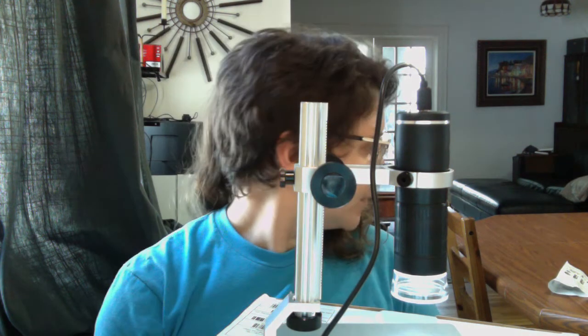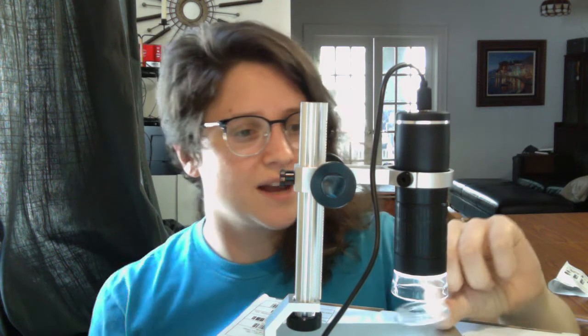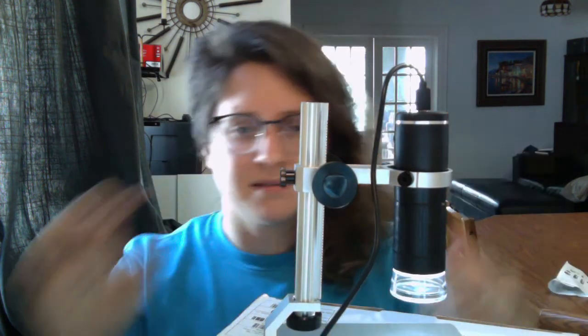Other than that, a couple of features that are nice: it does come with a cover, which makes it nice for traveling. The lights seem nice and bright. The cable is a bit shorter than the cable that came with the Celestron.